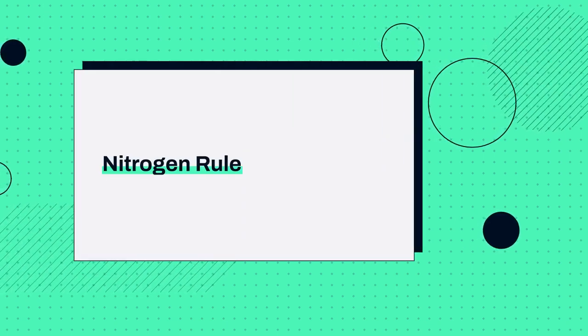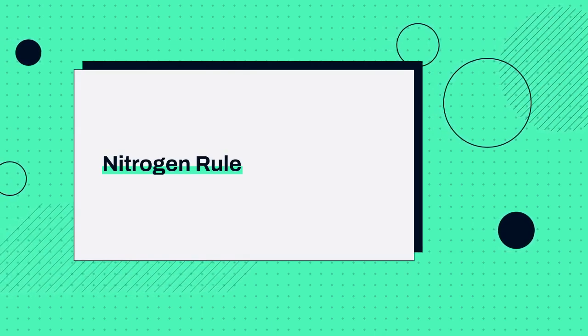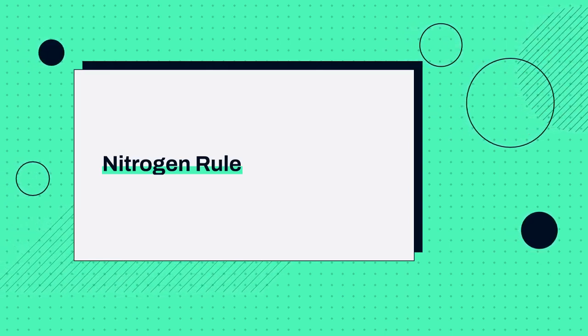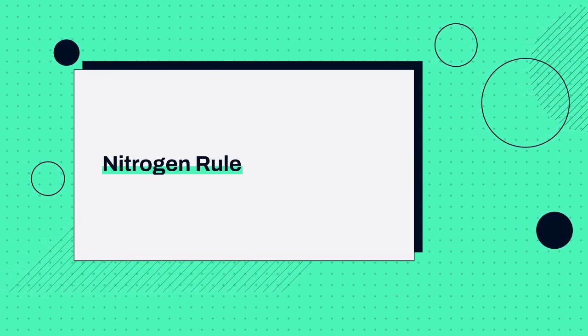Another great clue is the nitrogen rule. This simple rule states that if the molecular weight is an odd number, the molecule must contain an odd number of nitrogen atoms. If the weight is even, like our 94, it has either 0 or an even number of nitrogens. Finally, you can use the smaller isotope peaks for confirmation.